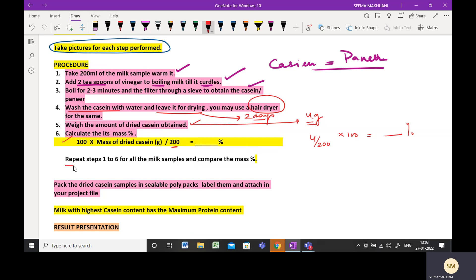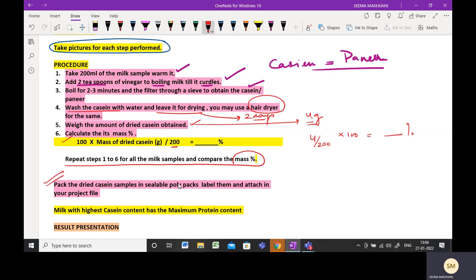Please repeat these steps for all the milk samples and then compare the mass percentages. Also, please pack these dried samples of casein in sealable polythene bags and attach them into your project file.